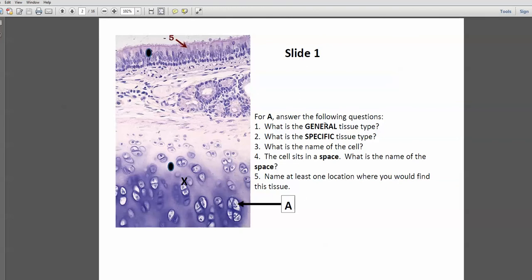This is slide one, and I was specifically pointing to A here. So we're not looking at any of these tissues other than here where A, the arrow for A, is pointing. Now, general tissue type. Well, obviously this is not nervous tissue. We don't have a free space, right? We have cells dispersed in a matrix. So this is connective tissue.